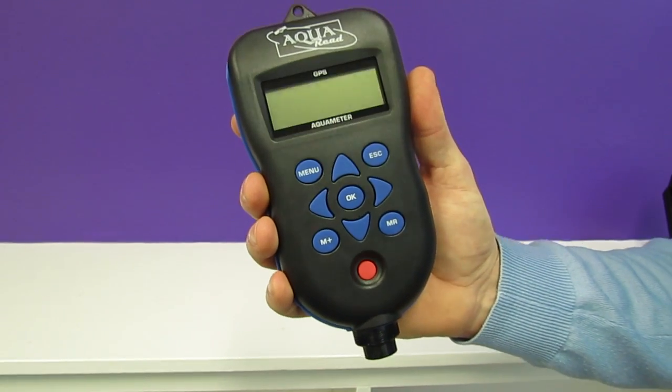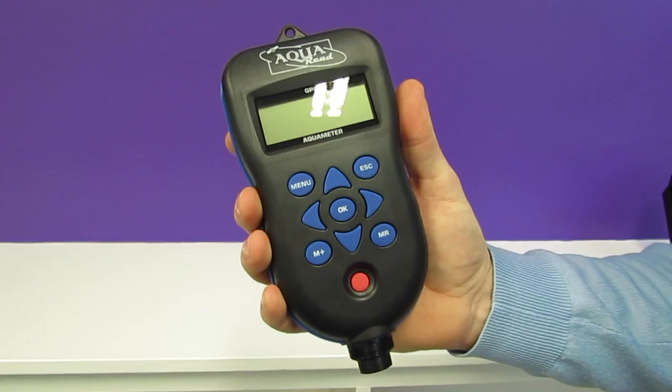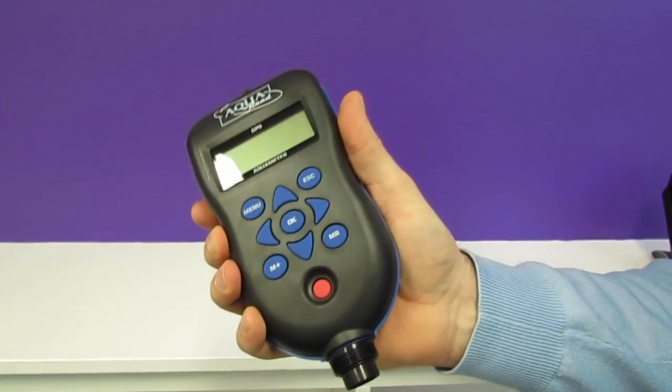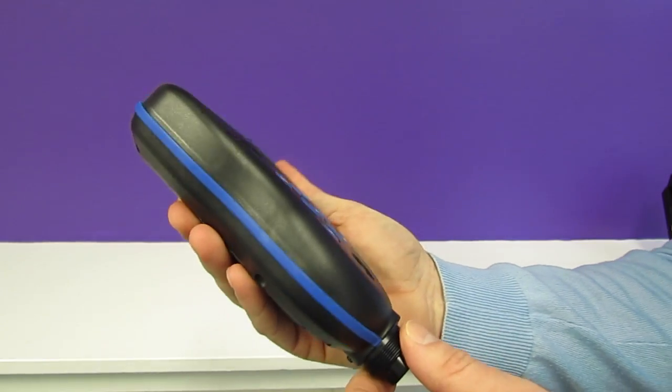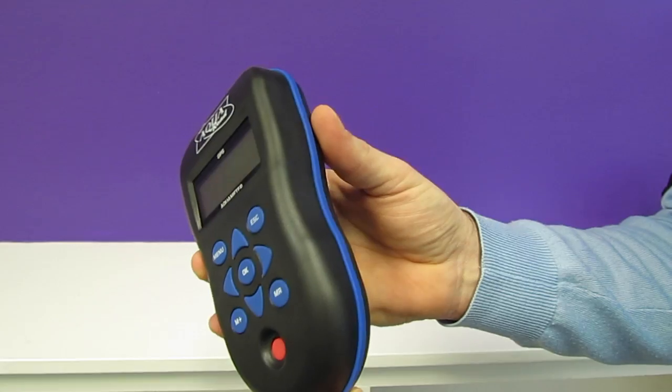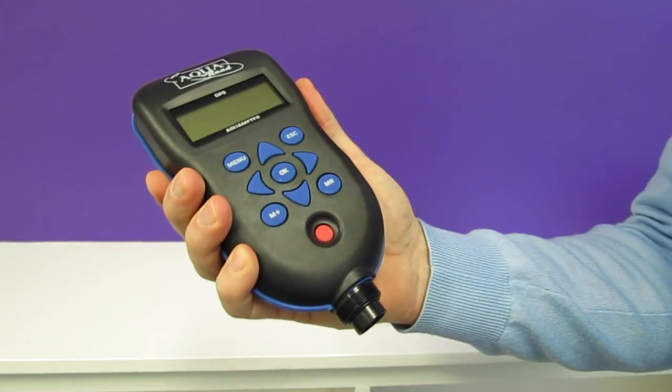This is our GPS Aquameter, the original water quality meter to feature a built-in GPS receiver. The meter sits very well in the hand and is ergonomically designed, and features a rubber gasket that runs the length of the meter to help keep it in your hands even in wet conditions.